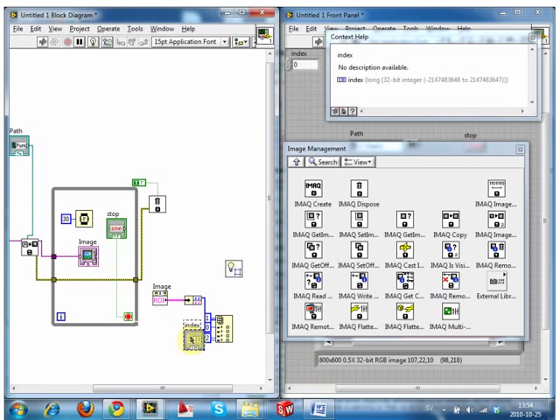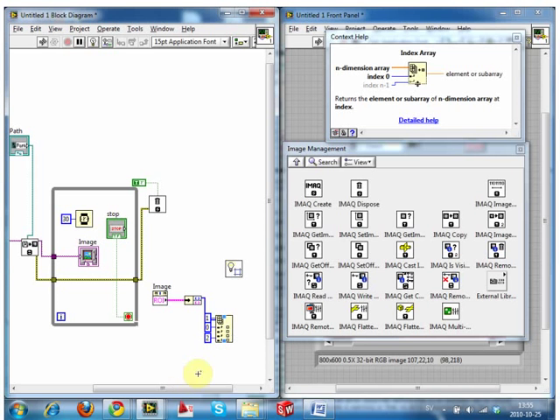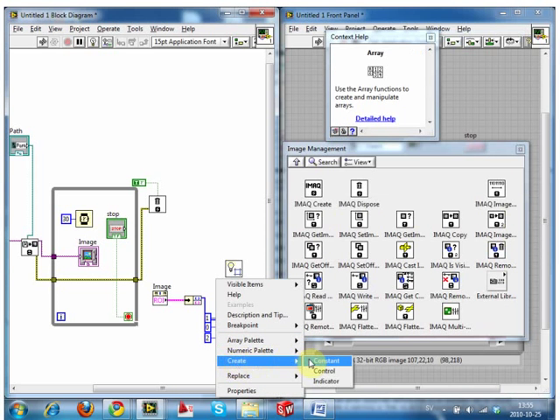What constant is that? Like, what does it mean, constant? We're just giving it a numeric value. It literally just means 2. It's just a number. It's a value.